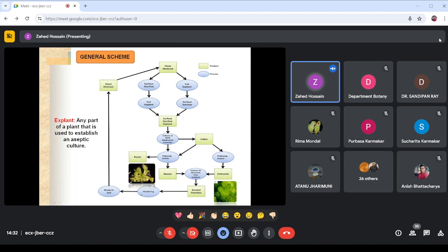So this is an essential step for plant tissue culture, because these small plantlets are basically newborn babies. Okay, so you have to take care of these babies. If you directly take these plants out of the culture tubes or the culture vials and directly shift them to field condition or the net house, they will not survive. That's why there is a step called hardening here.